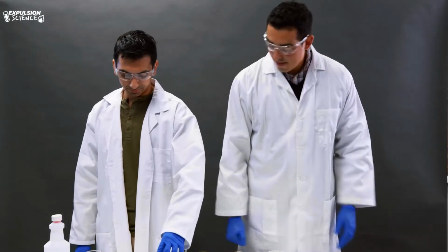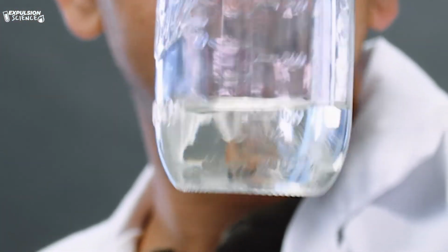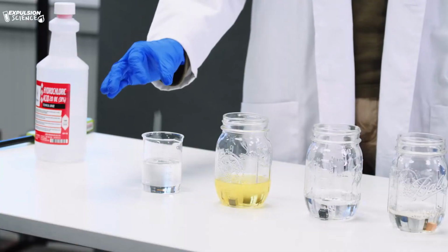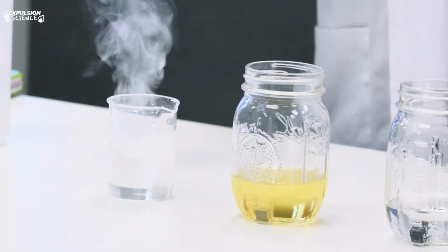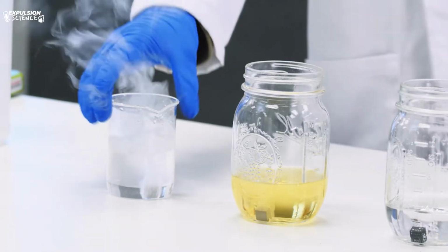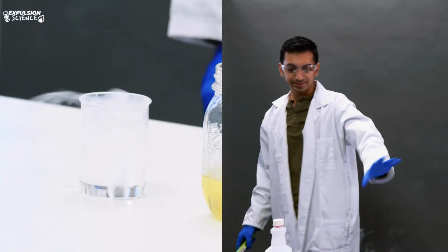Our iron seems to be really reacting. Look how much iron is reacting. There we go. This could be zinc chloride gas, or it could be hydrogen gas, or it could be water vapor. Definitely don't want to light this if it's that reactive.